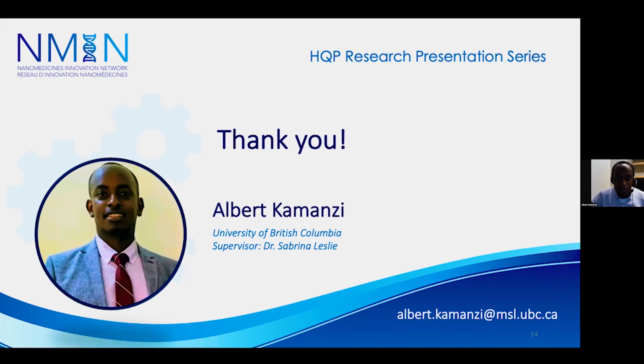Great, thank you. The second question comes from Ariadne Tuckmantle-Lido again, who wrote, amazing talk. I was wondering how hard it is to apply this CLiC method to get single particles, and if that would work with other particles, like gold nanoparticles. This may be very interesting for Raman studies that struggle to get single particles for analysis.